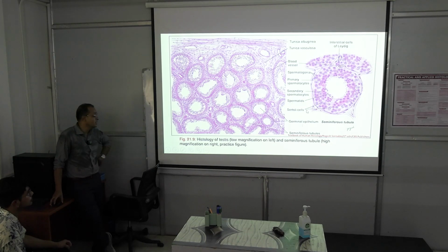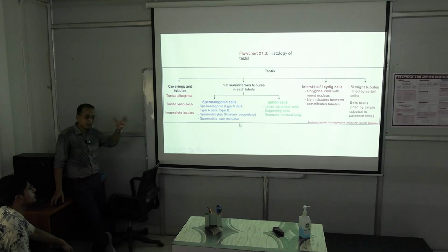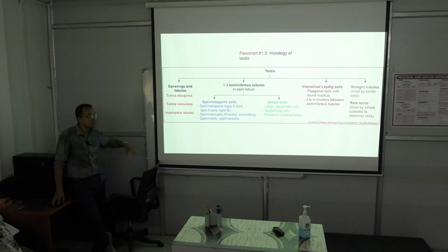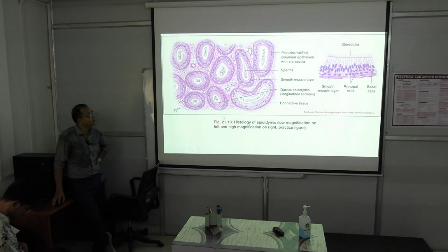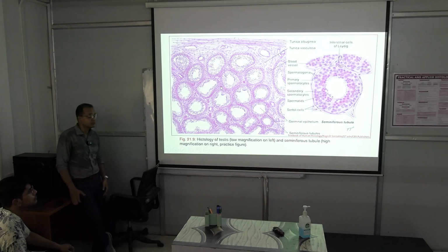These Leydig cells produce testosterone, and they are present in this region. If the testosterone-producing cells are damaged or destroyed, so no testosterone is produced, then the sperm dies inside. So, this is how they look histologically. Seminiferous tubules with lumens, and within these lumens we have two different types of cells. Histologically they look the same.